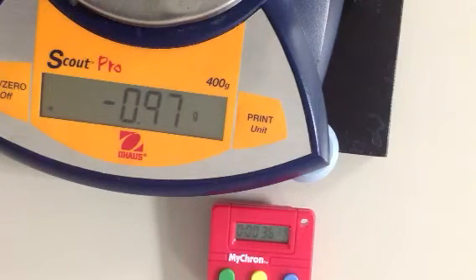Okay, so let me ask you this. The term rate, anytime I measure a rate, what is one of the measurements I have to take? Time. Everything having to do with a rate involves time. And so I have my time measurement there on the stopwatch. I have my mass measurement. I could have left it not zero and we'd have had to do some math, some subtraction to figure out how much mass is lost. But by zeroing it out, I skip that whole math step, right? And so we can watch the mass change over time.